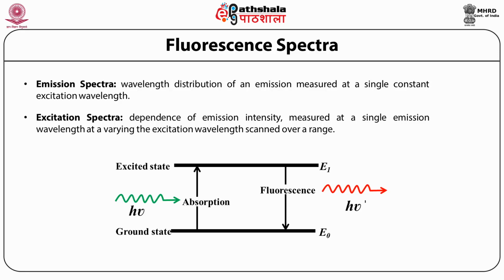The fluorescence emission occurs as the fluorophore decays from the singlet electronic excited state to an allowable vibrational level in the electronic ground state. This rapid vibrational relaxation process occurs on the time scale of femtoseconds to picoseconds.